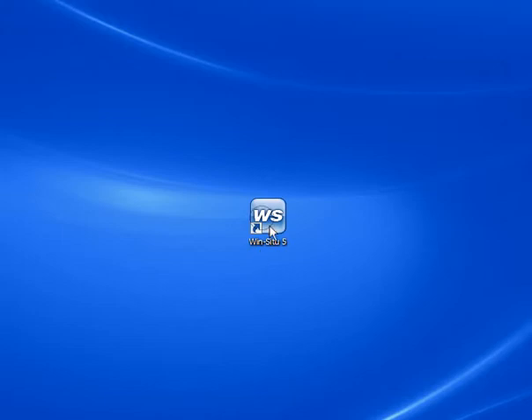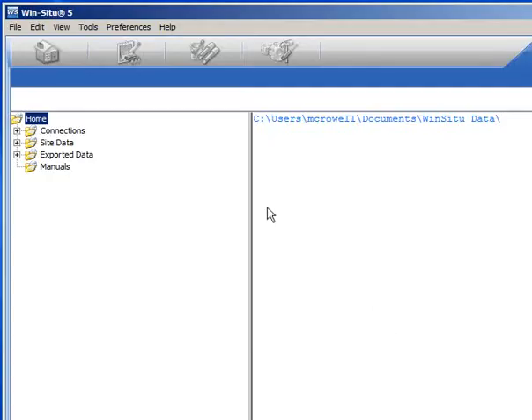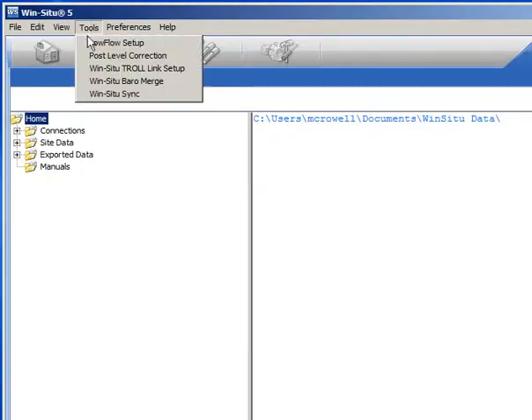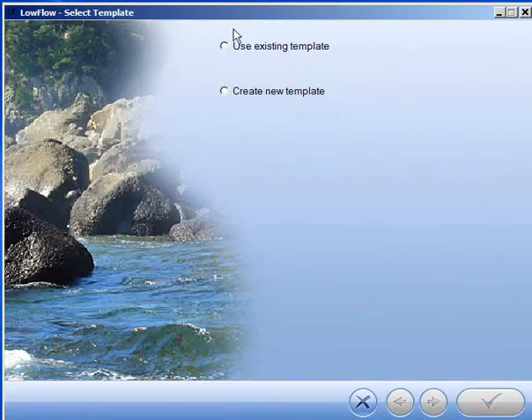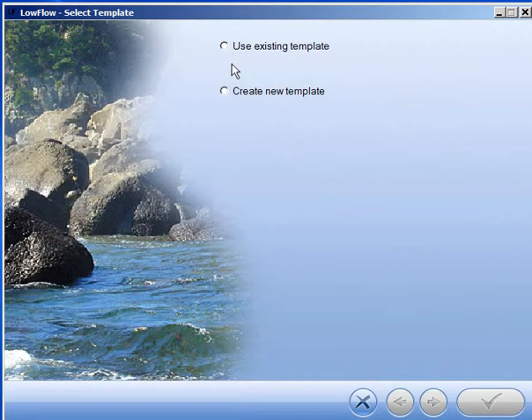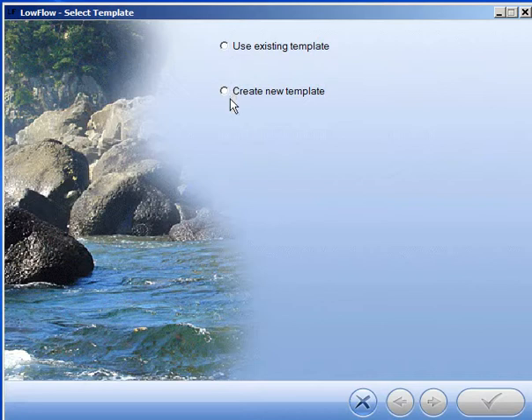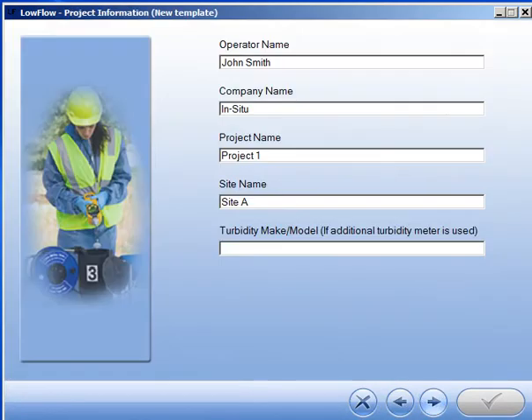Open WinSitu 5 software on your desktop, go to the Tools menu, and select Low Flow Setup. You can select an existing template, or you can create a new one.